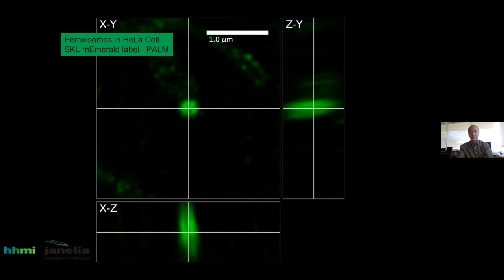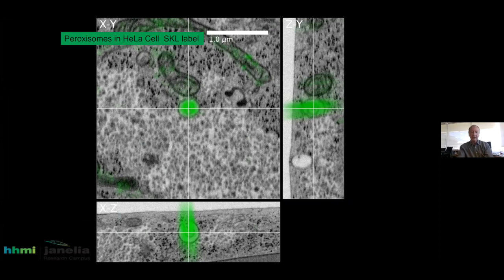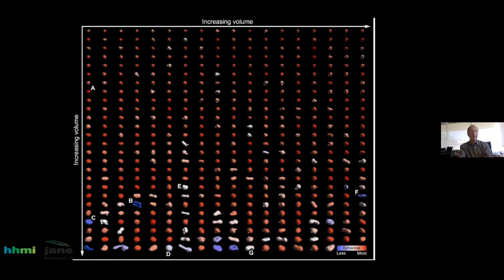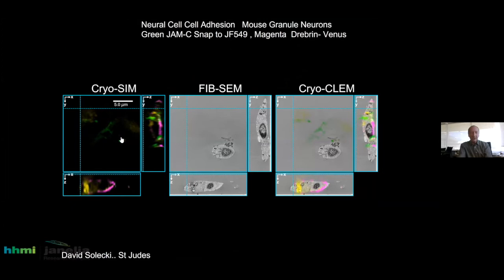And we can do this in a complete way. Here we label just peroxisomes in a HeLa cell, and we can see in the EM, it looks like this, this little surrounding structure. Another one, so it has a little bit of a curved dish shape. Here's another one. And we can just do this for all of the peroxisome spots in a cell and get a complete characterization of how many there are. Without combining the two, we'd be left a little bit in the dark of, is this truly a peroxisome? Is it some other kind of vesicles? Because their shapes do vary a little bit. So one can get nice comprehensive statistics on the whole thing.